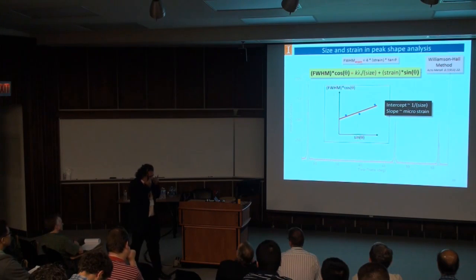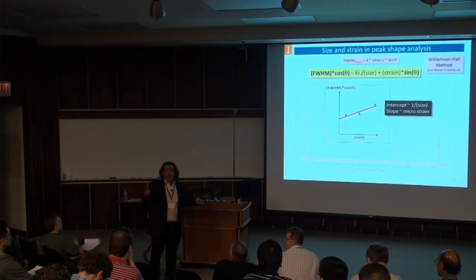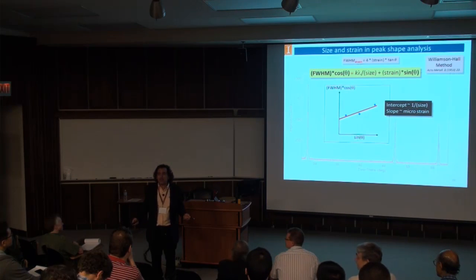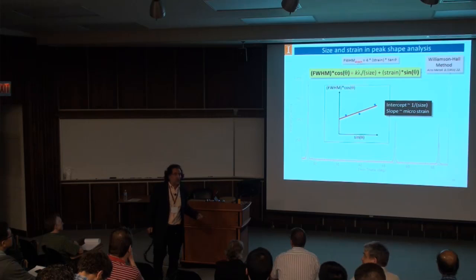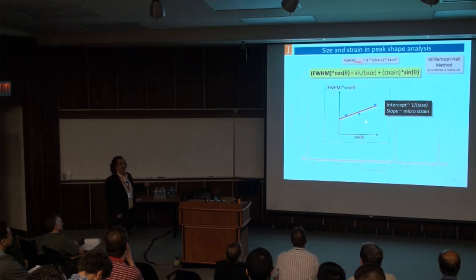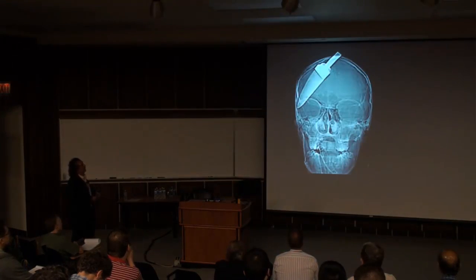Oh, but my boss allowed me to do Williamson-Hall, and someone from your group, not you, says it doesn't work, I don't know what to do. Well, the system is more complicated than this. There are dislocations that you are not accounting for, point defects. This is just a simplistic thing, right? But it's a good first step, actually. Many people publish a lot with that.